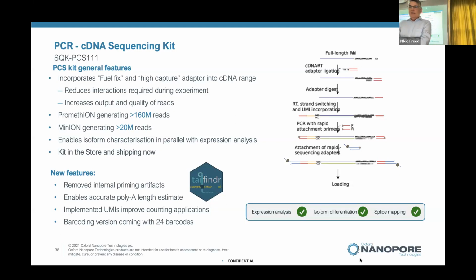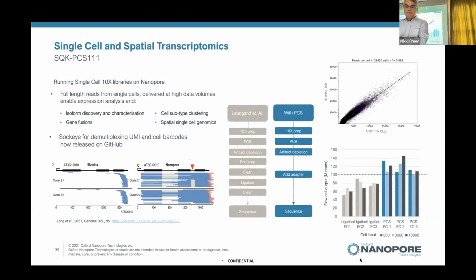microarrays are at, except microarrays don't discover anything new, whereas this will, and it'll give you the poly-A as well. So this should replace microarrays and RNA-seq. It'll take a while to do it as people get used to it. The analysis becomes more streamlined, but I think for the cost, it's right where we need a technology to be.